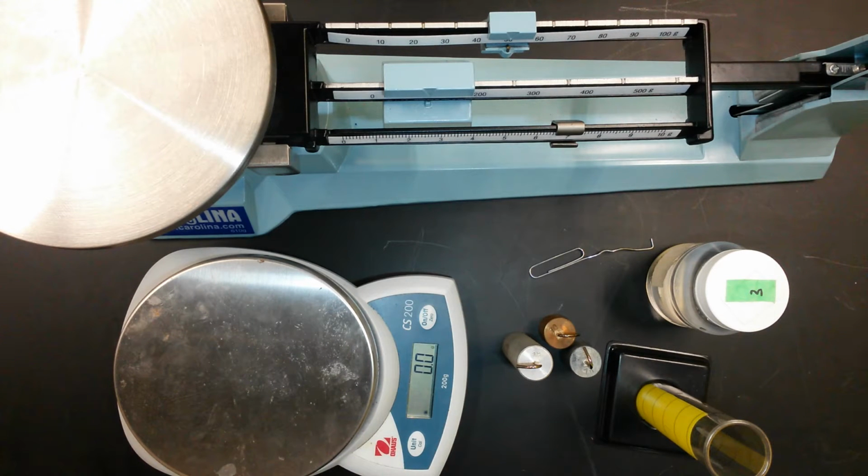I'm going to talk to you right now about Lab 1.4, in which we're going to be measuring mass and volume. Now, we discussed mass and volume in one of our classes, and it's kind of hard to tell exactly how they're different from each other, since they're both ways of measuring the amount of matter. We know volume is the amount of space that an object occupies, and mass is the amount of matter in an object.